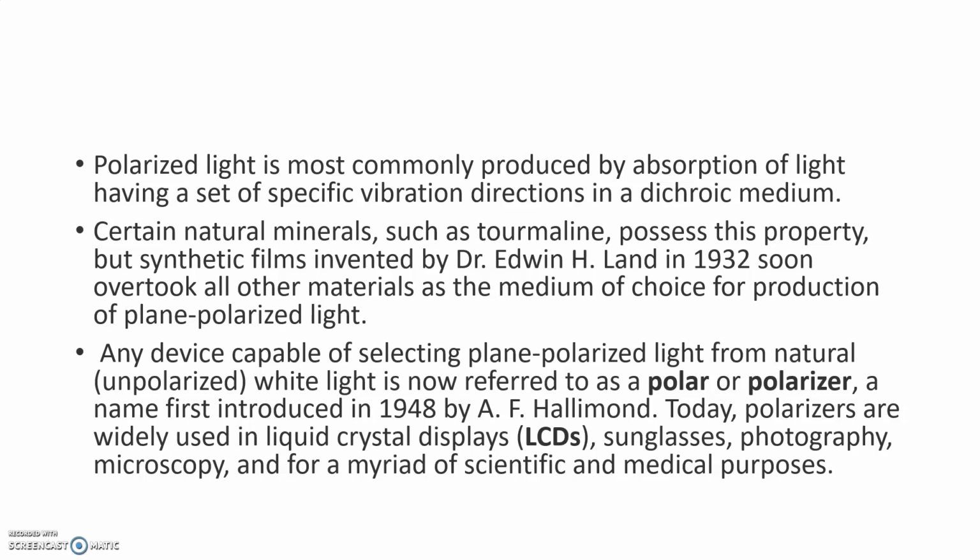The name was first introduced in 1948 by A.F. Hallimond. Today, these polarizers are widely used in LCDs, sunglasses, photography, microscopy, etc.